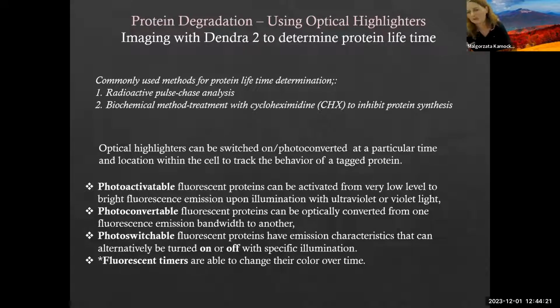We do not have a SPIM microscope yet. We may have one next year, so we are still limited to this 2 millimeter working distance, so 2 millimeter volumes as of now. But next year it may change, and we may be able to image entire organs as well.